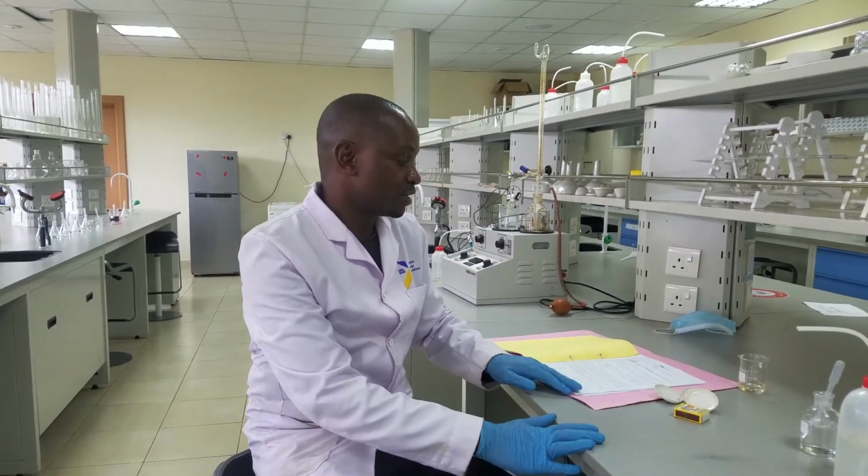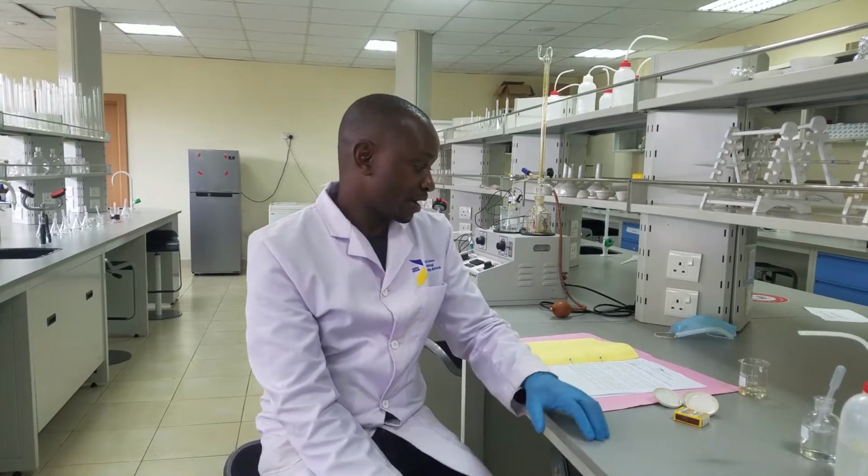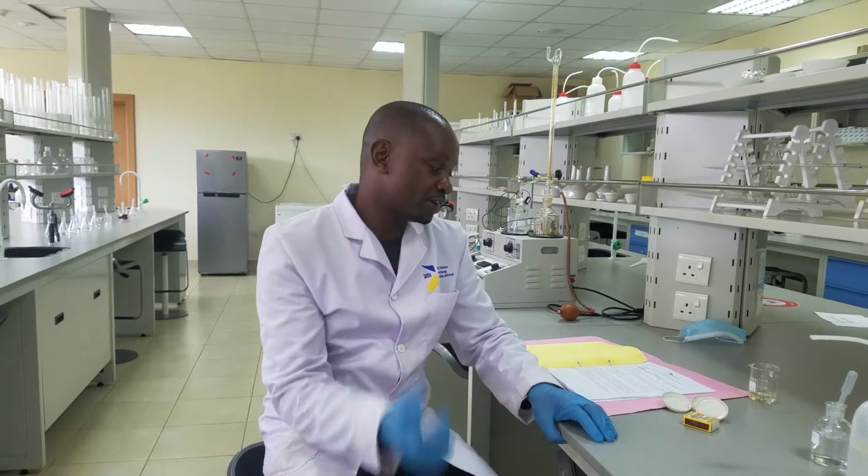Afternoon, students. Once again, welcome to our experiment number 6. In this experiment, we are going to talk about hydrocarbons, aldehydes, ketones, carboxylic acids. I believe you have done this in class. You have been introduced to alkanes, alkynes, alkenes. Hydrocarbons generally are molecules which consist of carbon and hydrogen.